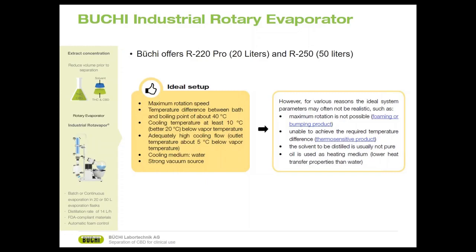However, those ideal conditions are not always met because of foaming and bumping products. It's unable to achieve desired temperatures also due to thermally sensitive materials like cannabis, and the distilled solvent is not always pure. So it is not always possible to reach the ideal conditions, but by using the proper functions and proper foam sensors, you can also increase the time of the distillation.